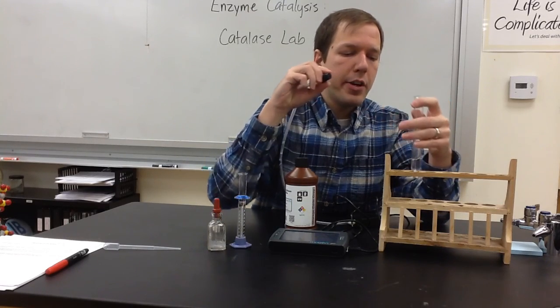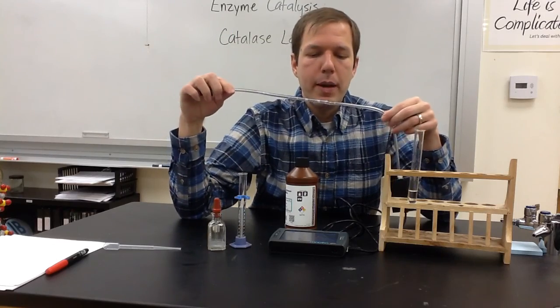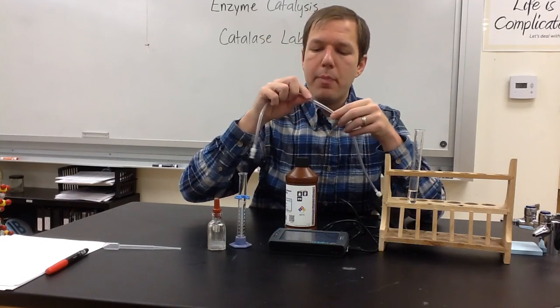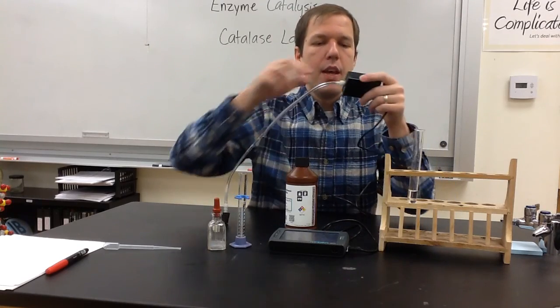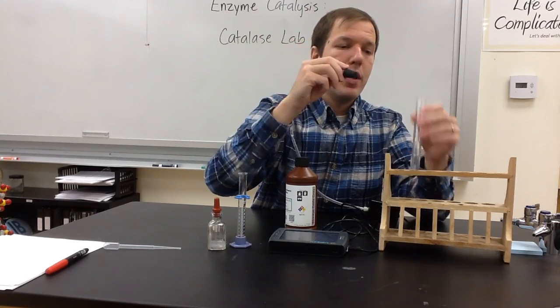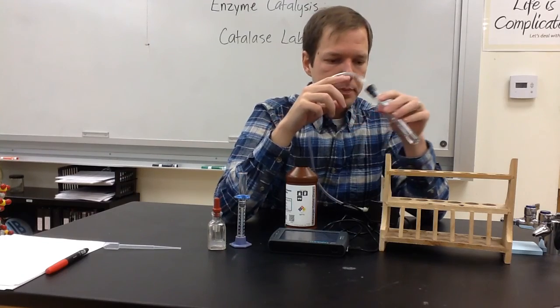A couple of other logistical things to be aware of. One is to check your tube. These tubes have been used a number of times for many different labs, so you need to check for any damage. Make sure that there's not any holes in the tube, particularly from burn marks, because if there is, then air will leak out and you will not see any rise in pressure. Similarly, make sure you check your connections at either end of the tube. And finally, when the stopper gets added in, you want to make sure that you push and wiggle, twist it into place to be sure that you get an airtight seal.